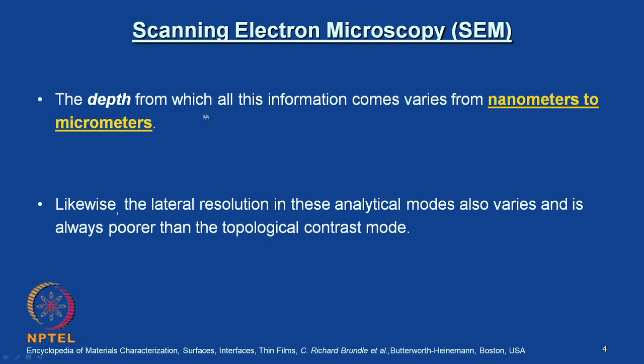The depth from which all this information comes varies from nanometers to micrometers. This is also subject to specific instrumentation details. We will look at them at an appropriate time. Likewise, the lateral resolution in these analytical modes also varies and is always poorer than in the topological contrast mode.